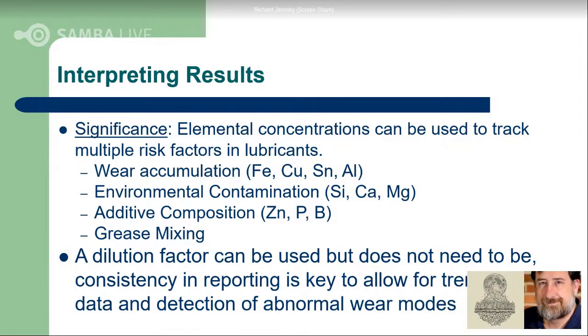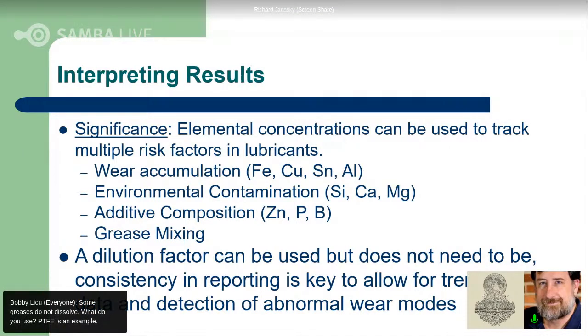Yeah, Lisa, this is Rich. So, we had a little discussion earlier about, some people use RDE, some use other methodologies. They may be using ICP, maybe even XRF. And it really comes down to the consistency of method, consistency of dilution, preparation, because once you change these variables, you're really out of the realm of being able to apply some kind of standard criteria or something to say, here's an action level, right?